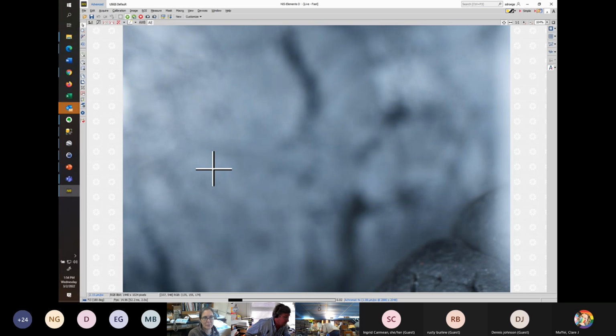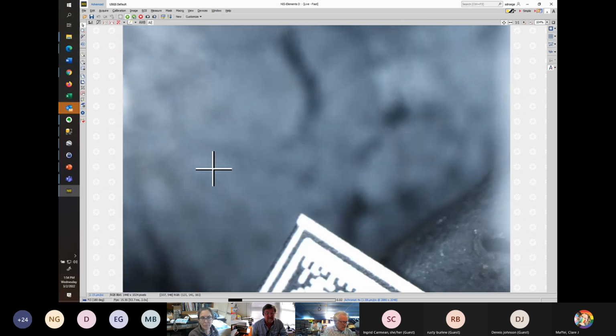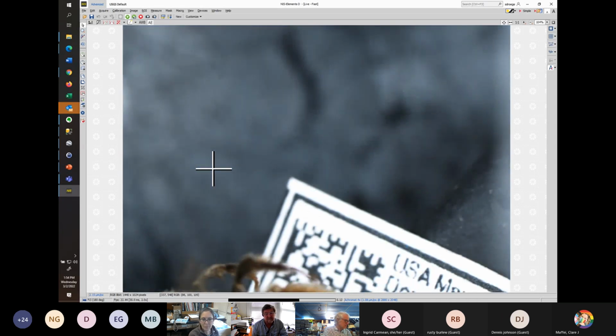Subilatus and elatus. Yeah, that's a group that I struggle with a lot. So I'm pulling out something that I've got down as subilatus. So you guys want to talk about where you see them and any general characters? I'm often looking at T4, but I'm not sure that's the best. How are you guys separating them?